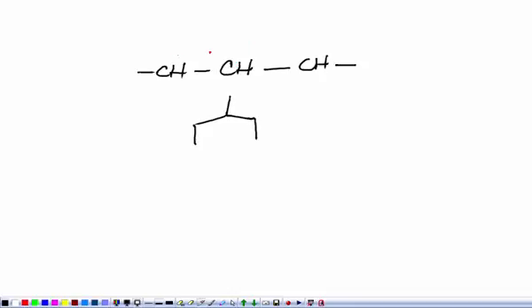So the first peak, I'll call this A and C. So in the middle's B. So B starts out as a singlet, but then it's split by A into a doublet. But then it's further split by C into another doublet. So that means that each one of these peaks from the first doublet, they now get split into doublets. So the pattern for B is what we call a doublet of doublets. In other words, it's split into a doublet on one side, and it's split into a doublet on the other side. So the first doublet gets split into more doublets. Okay, so we end up with a doublet of doublets. You can kind of see that here in this pattern. I'd end up with 2 peaks and another 2 peaks. So it would be a doublet of doublets.